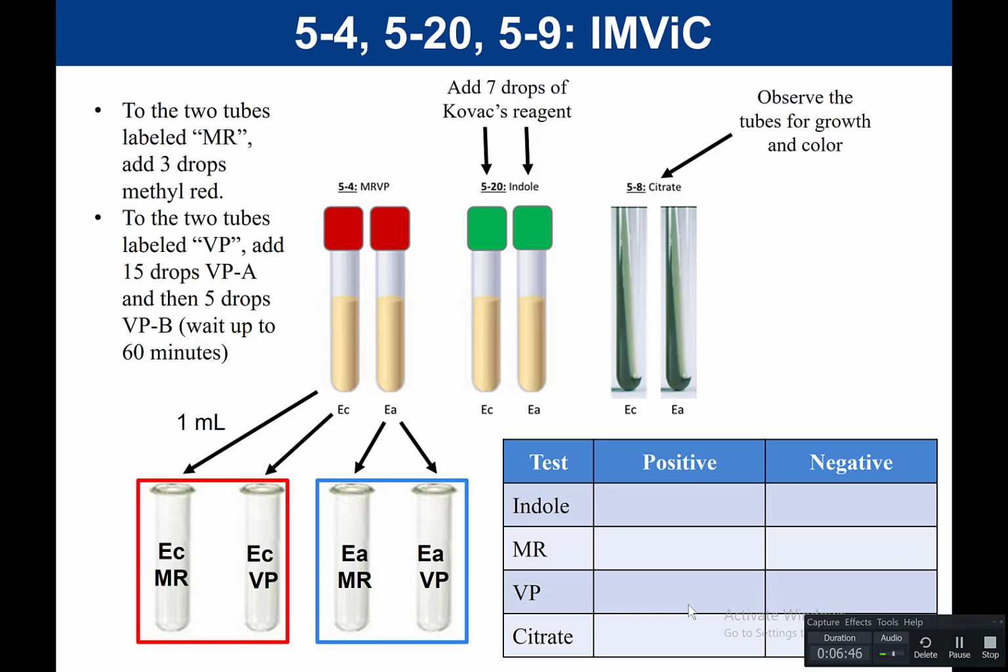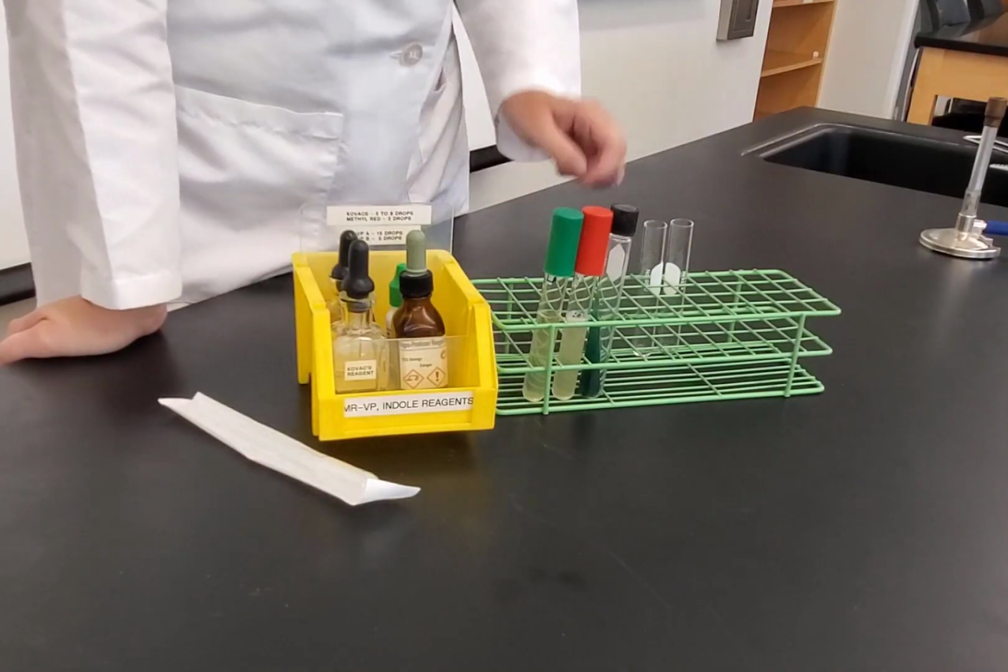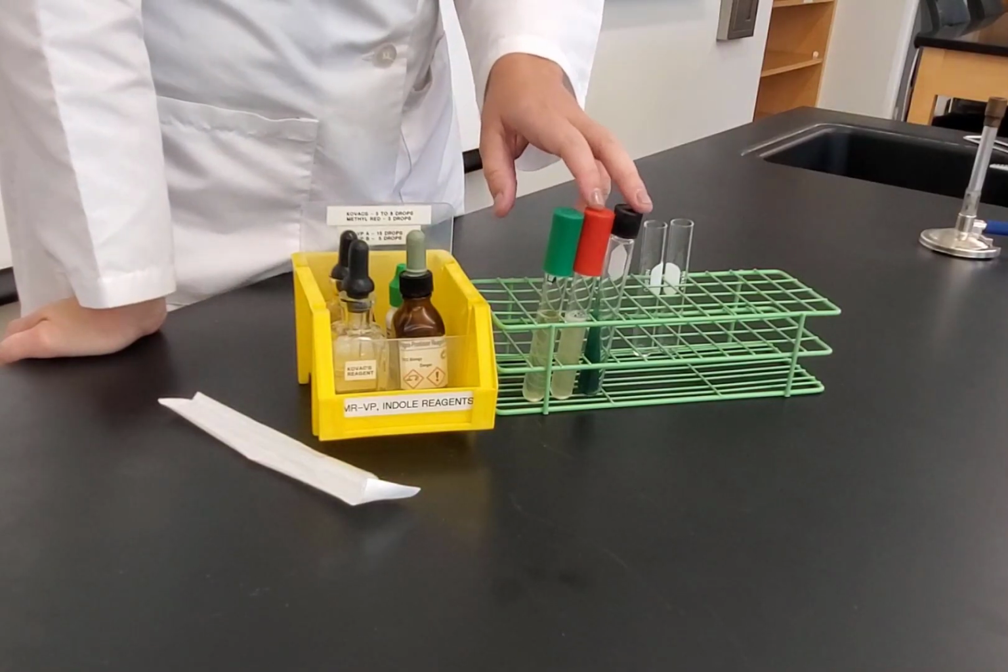So I have a video now that I'm going to show you that demonstrates the procedure of doing the readout. And then we'll talk about the different tests, the biochemical sheets, and also what the readout tells us. So here's the video showing you how to do the readout. Okay, so this is the second part of this experiment, doing the readout day.